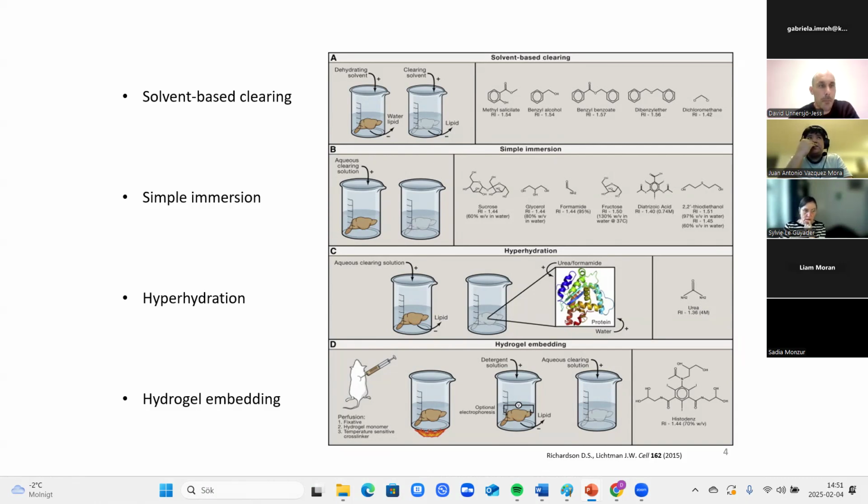Yeah, because so far that I know, in the solvent protocol there's a part to bleach the sample and then rehydrate and do the staining, the dehydrate. But what is so specific about methanol, or for example ethanol, is it different, or because both are alcohol?